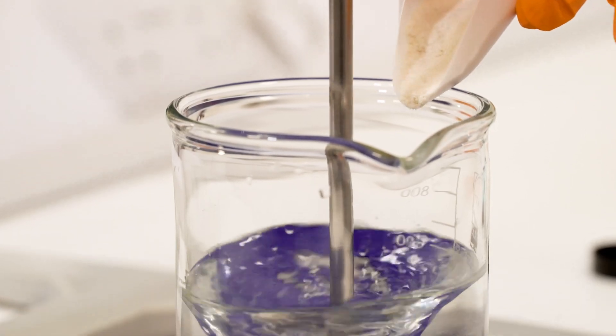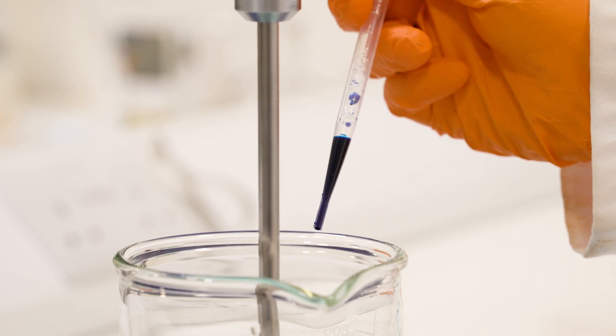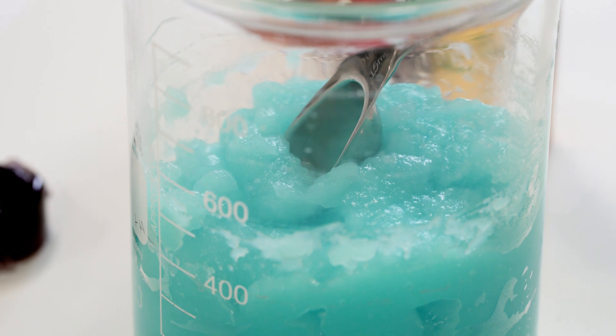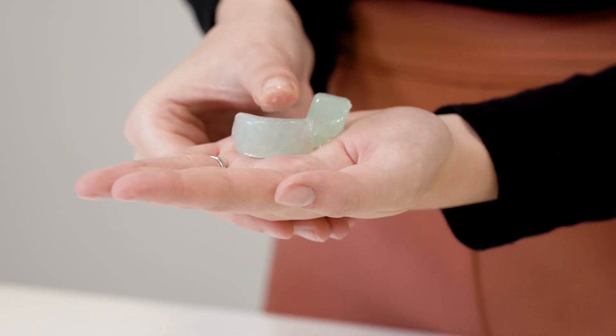For an elastic gel, you use a high acyl gellan gum: incorporate it cold, heat it up as before, and incorporate calcium ions — but this time we've created a blue elastic gel. A formulation that uses the low acyl gellan gum is icy cleansing cubes, which have a very brittle structure that shatters almost like ice when you press on them.